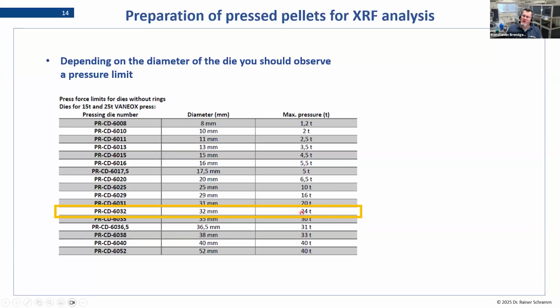So the actual pressure you apply to a certain sample depends on the material and your recipe. So sometimes it takes a bit of working out. We will have some examples later to give you an idea. And yeah, feel free to reach out to us if you want a recommendation for a recipe.